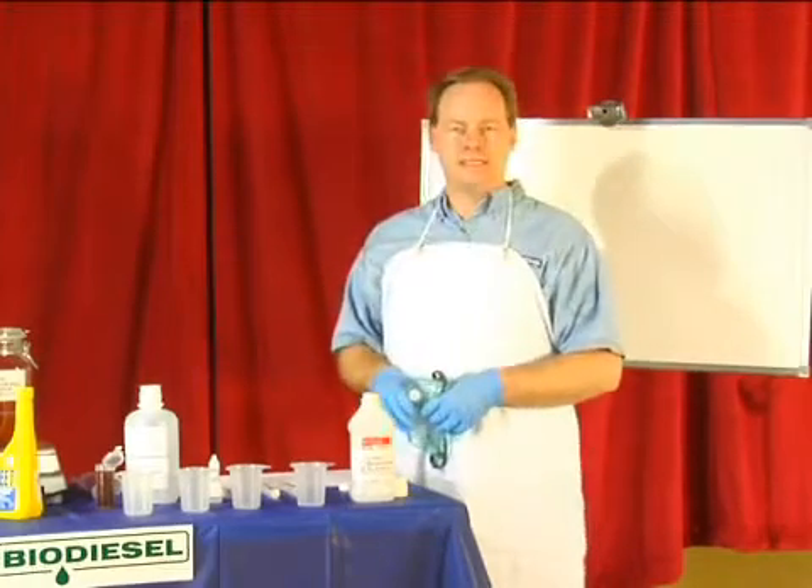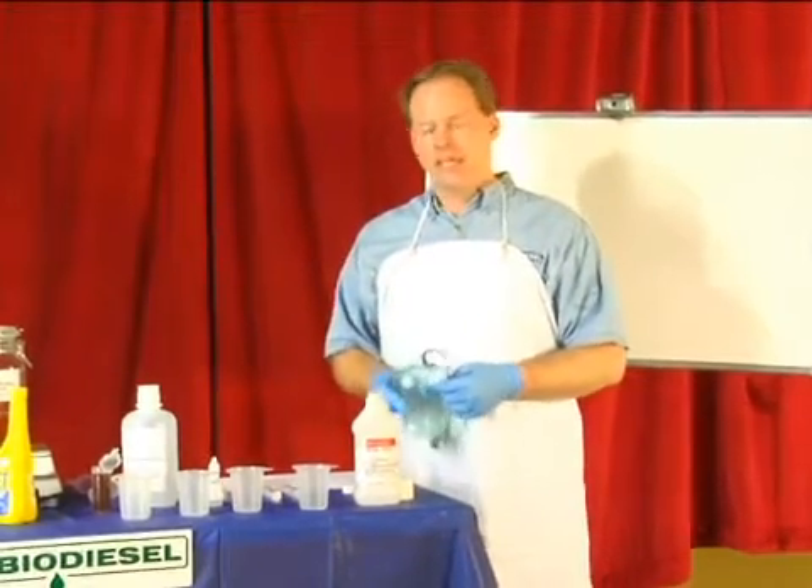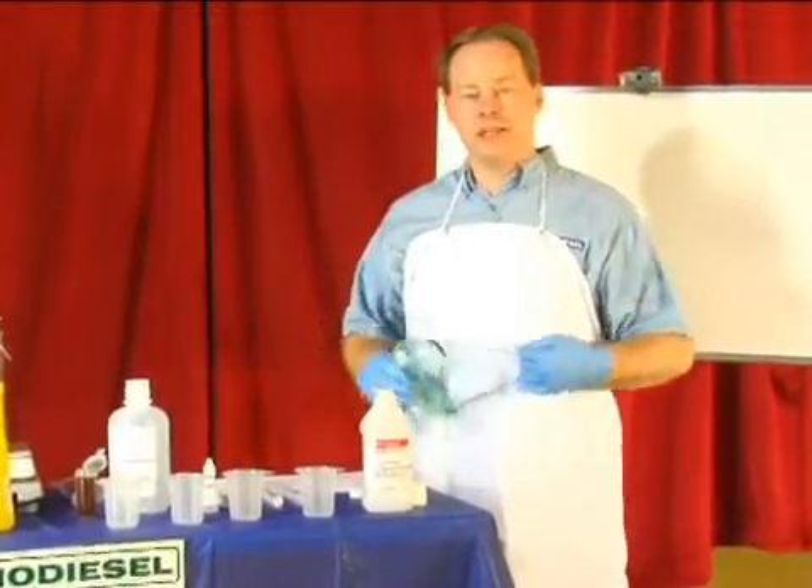My name is Graydon Blair from Utah Biodiesel Supply, and on behalf of Expert Village, I'm going to show you how to do a blank titration to get ready to titrate your oil.